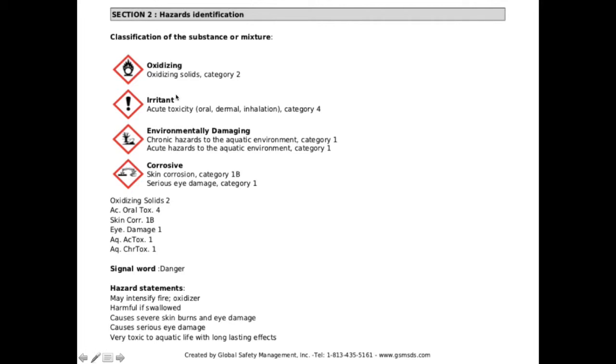So we've got, it's an oxidizer, which means it makes things catch on fire. That's what an oxidizing agent does. An oxidizing agent will take anything that is combustible, and when you add this to it, it will catch on fire. It's not the worst one out there, but it's a bad one. Okay, acute toxicity. By mouth, skin contact, or breathing in. No thank you. Does a lot of damage if you put it down the drain. So you have to do chemical disposal of this. That is annoying. Therefore, once again, that's another reason why I don't use it. It is a pain to clean up properly.